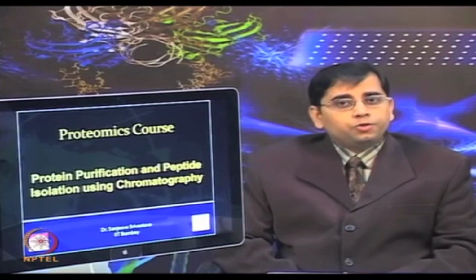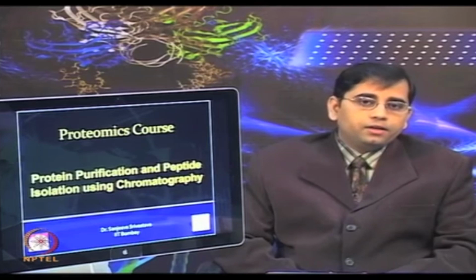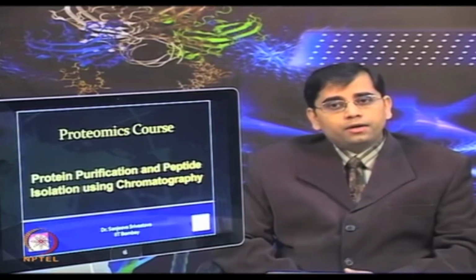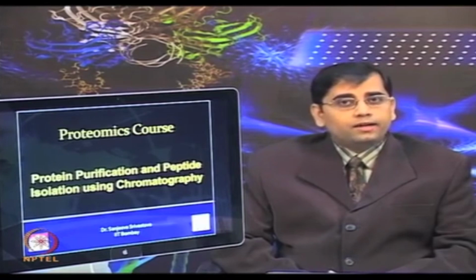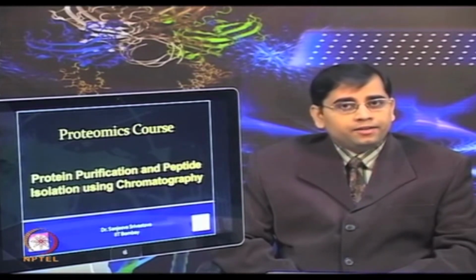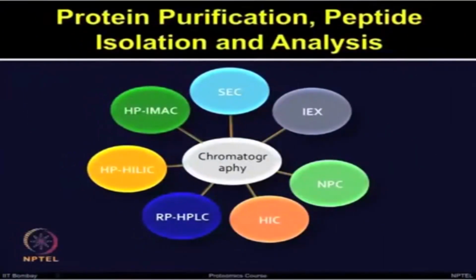From complex proteome, it is challenging to purify a protein in a single chromatographic step. Therefore, sequential pre-fractionation steps involving different modes and types of chromatography methods are becoming necessary for proteome level analysis. Protein purification, peptide isolation and analysis.